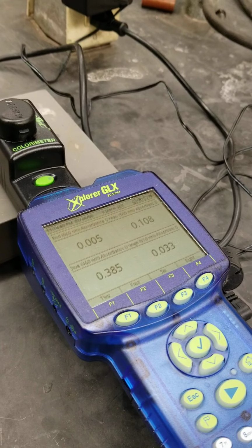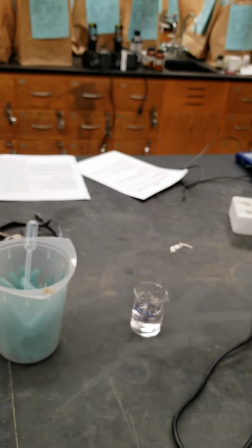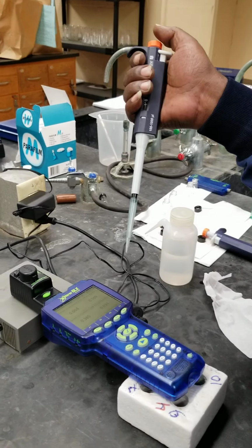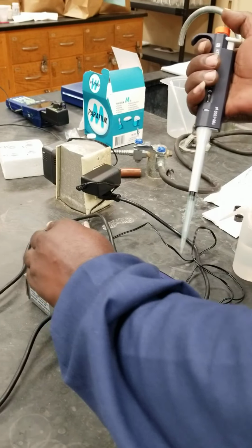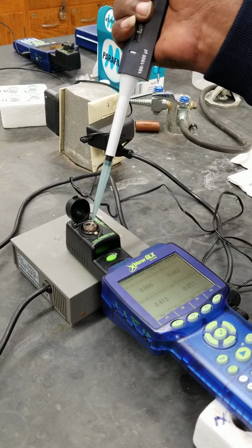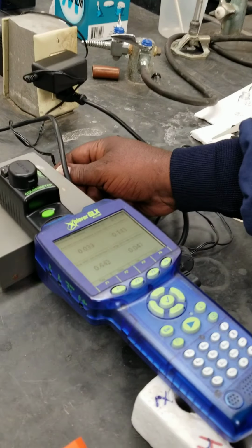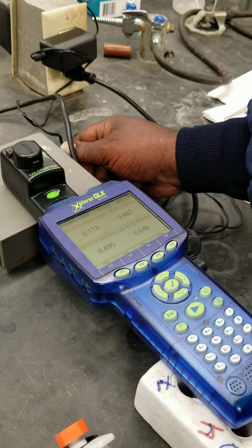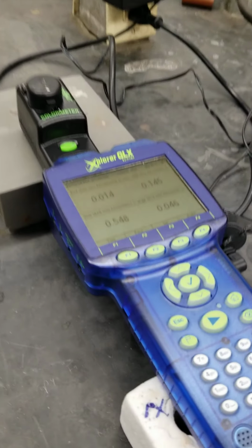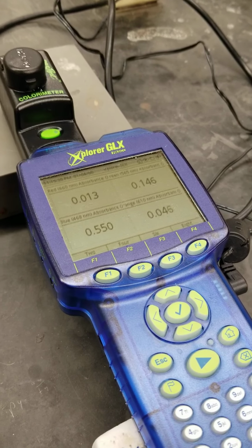So the third addition is 0.383. Fourth addition: the absorbance is 0.550.